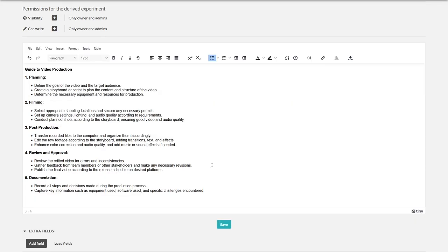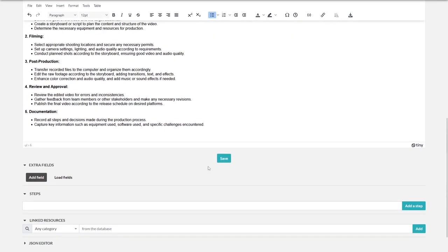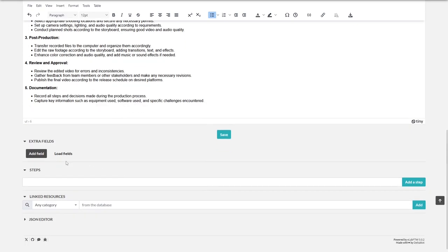Of course, you can also add extra fields, steps or even link resources. Fine. Let's press save and go back to the list.